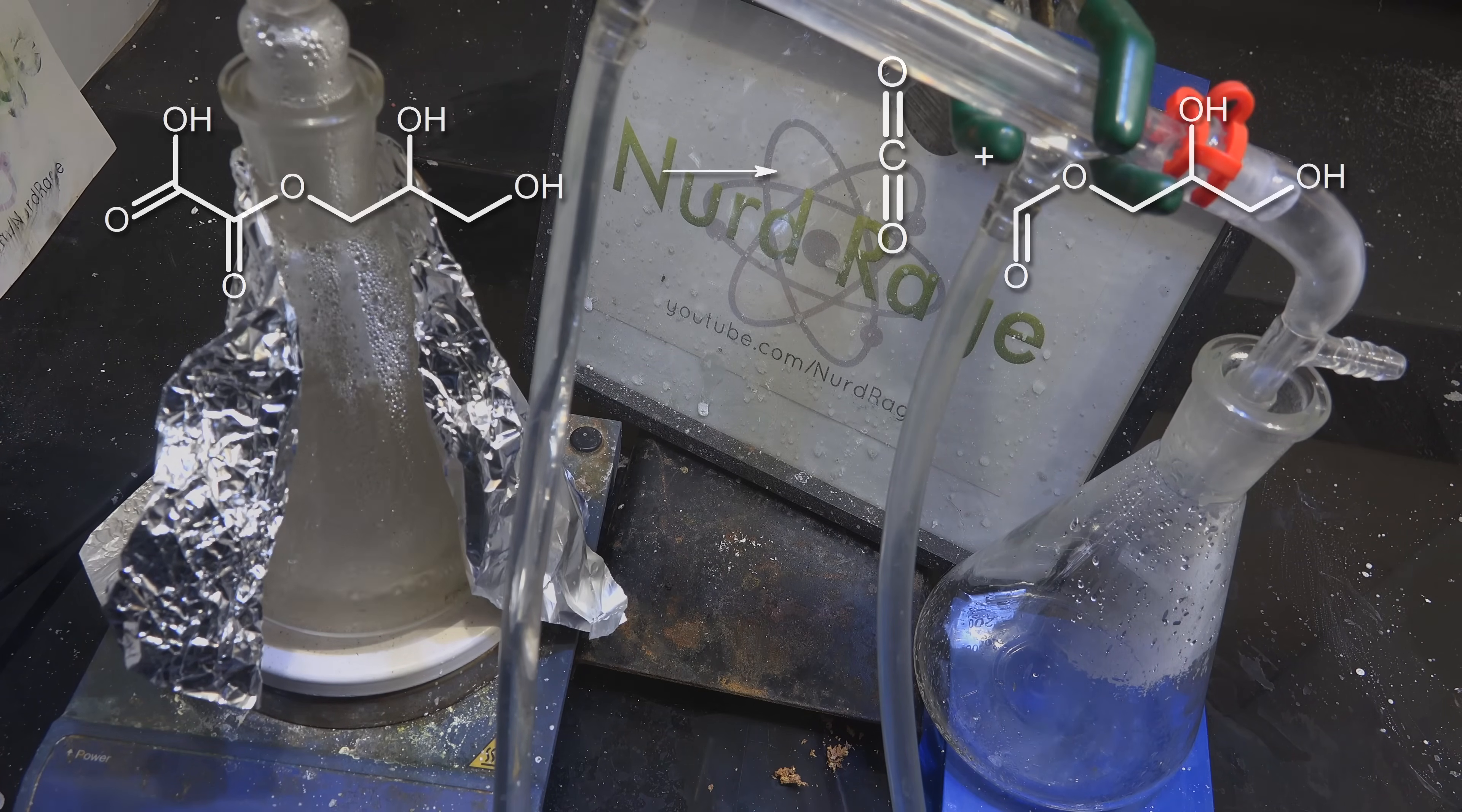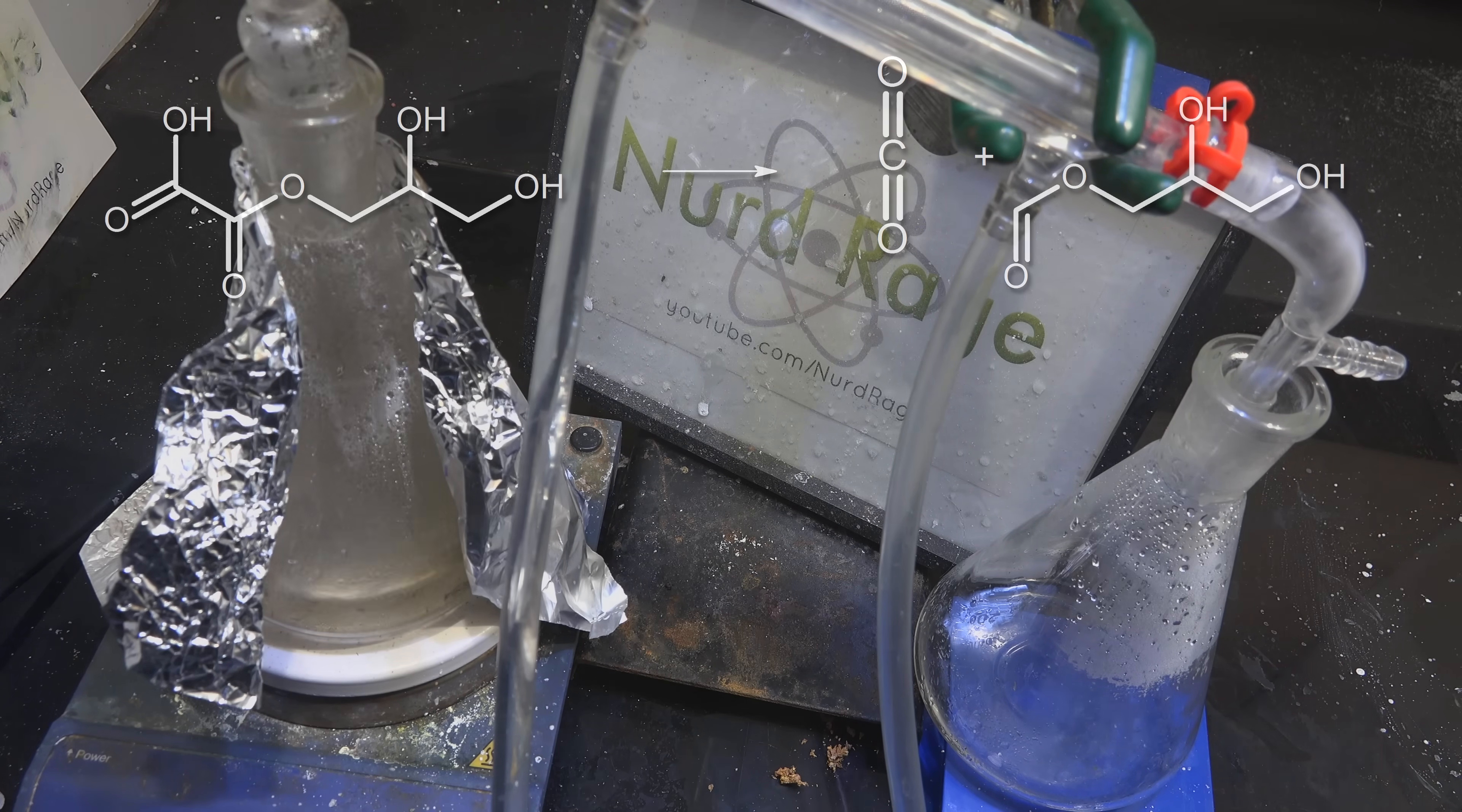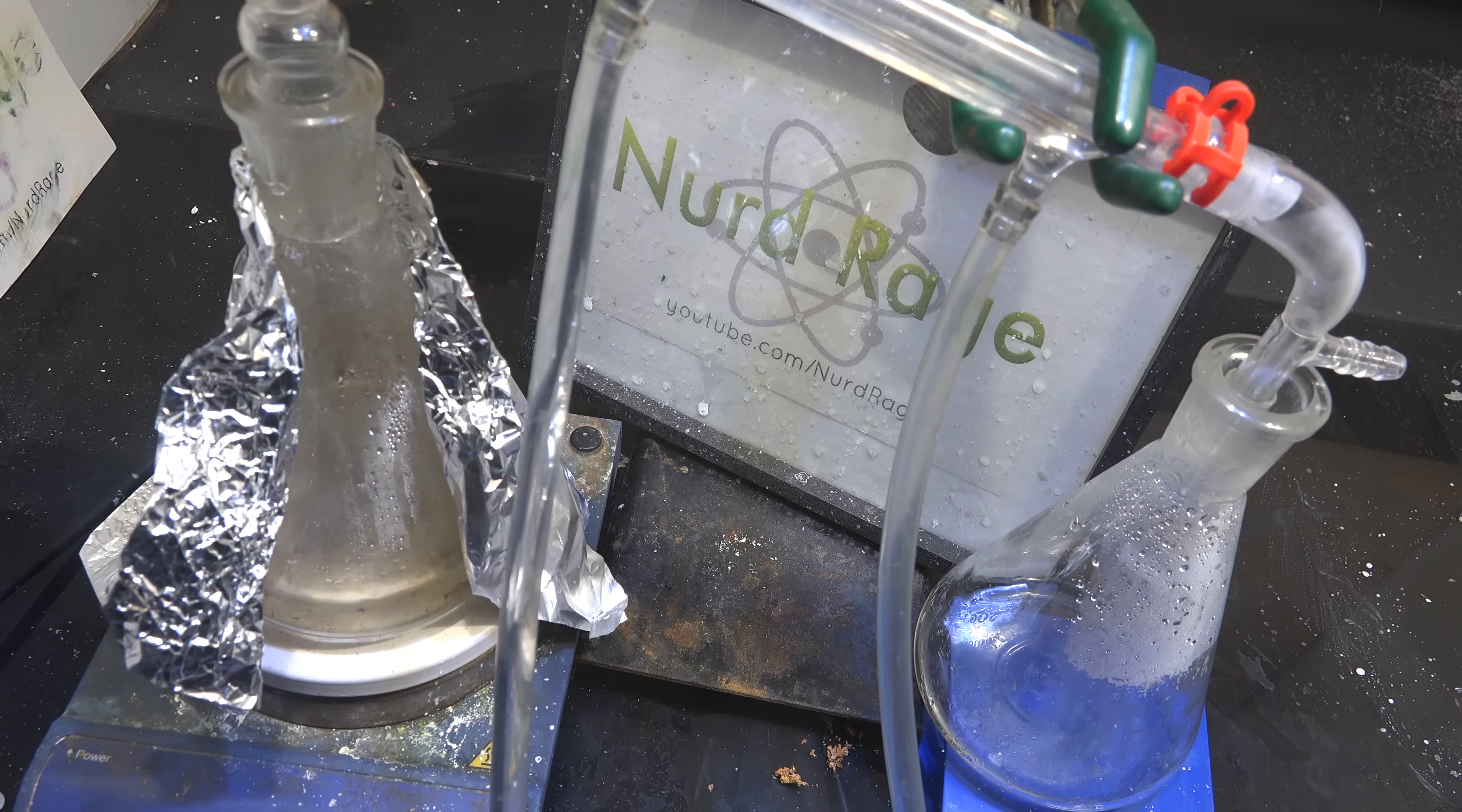As the heating continues the glycerol oxalate decomposes into glycerol monoformate and carbon dioxide. This is where we're essentially producing formic acid, although it's still esterified with glycerol. Now if there was some water present it would hydrolyze with the glycerol monoformate to produce glycerol and formic acid. But most of that water has already boiled off so we need to put some back in.